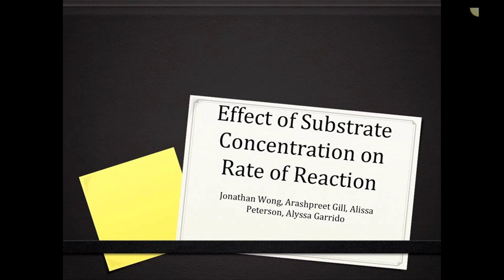Effect of Substrate Concentration on Rate of Reaction by Jonathan Wong, Arashpreet Gill, Alyssa Peterson, and Alyssa Garrido.